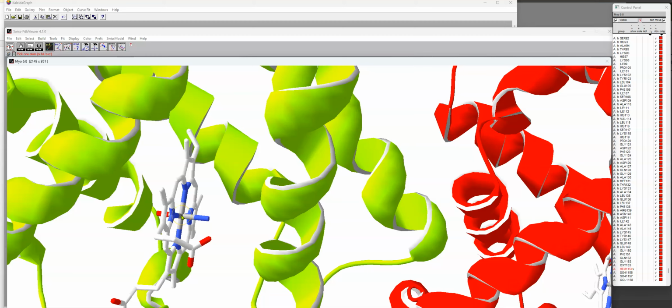And I'm going to try to make sure I click that atom. And after I pick one atom, I didn't like that. I didn't like that in there. So I got it that time. And now it says pick the second atom.